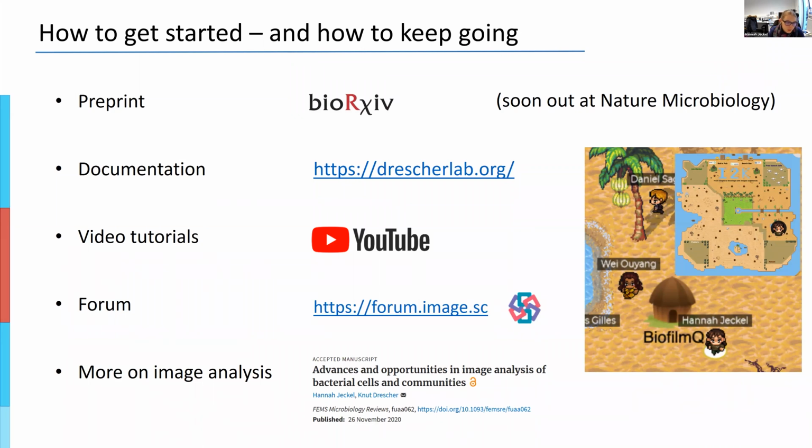And if you have now started using BiofilmQ and you want to keep going, if you need some more resources, I've mentioned basically all of these again, but I just want to have them on one slide. We have the paper that you can read to get some more information. It is going to be published soon in Nature Microbiology, probably at the end of this year or early next year. Then we have the documentation online that I have shown you before, where you can find everything, including the video tutorials, which you also find when you search for them on YouTube.